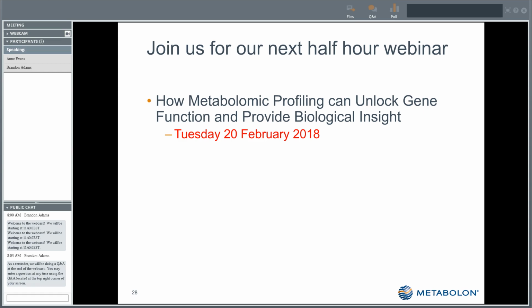And the last question I'll answer here is the question specifically around research in bacterial studies. Certainly we do a lot of work in bacteria. The microbiome aspect of this is humongous. One of the things that's really exciting about metabolomics is that we can see so many of the influences of the microbiome and bacterial metabolism, because bacteria have unique genes and unique enzymes that can produce unique novel metabolites that are not seen in human species. So we do a tremendous amount of work in this space, and it's a very exciting place to be right now because of all of the research coming out showing just how important that is.